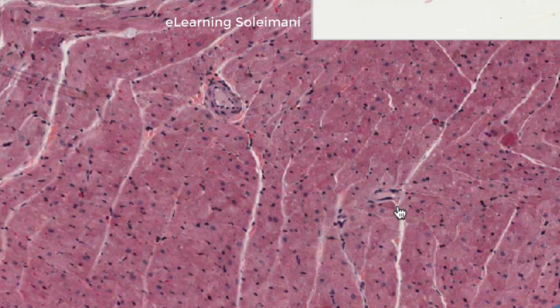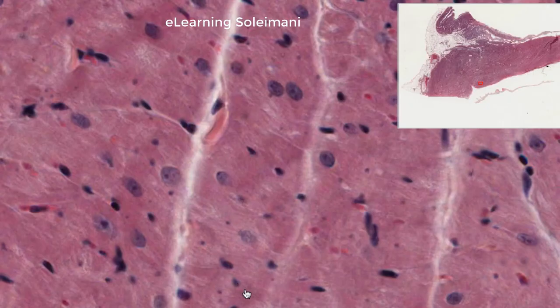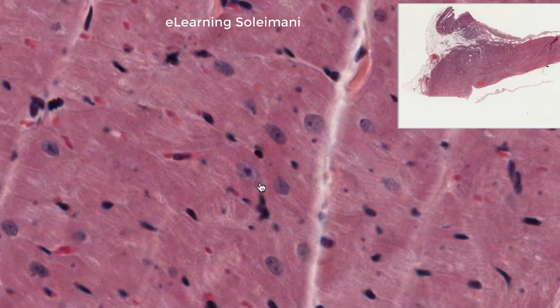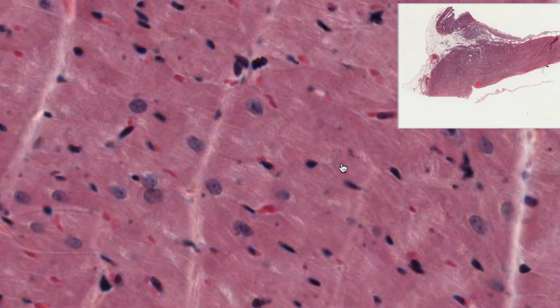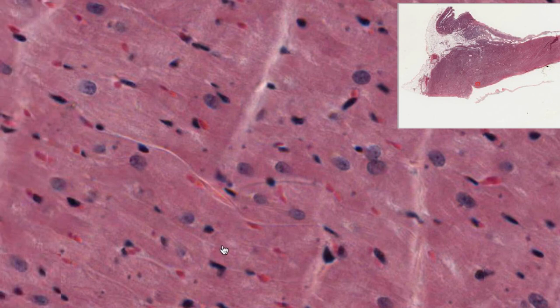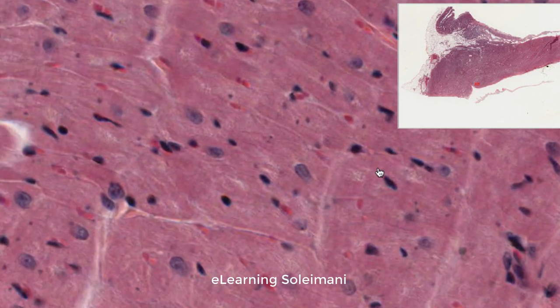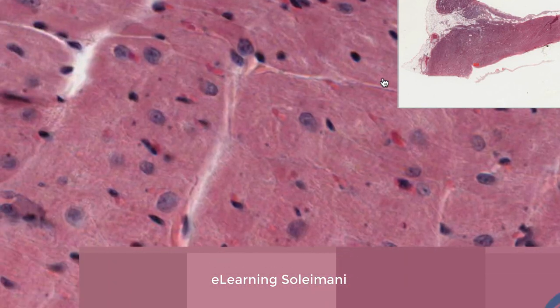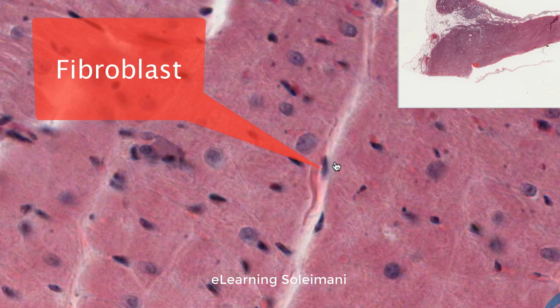Here we observe the transverse section of the cardiac muscle, where no nucleus may be visible in some cells because they were not cut through the nucleus. Depending on the location of the slice, some cells may have nuclei and others may not. You can also see connective tissue, including fibroblasts, between cardiac muscle cells.